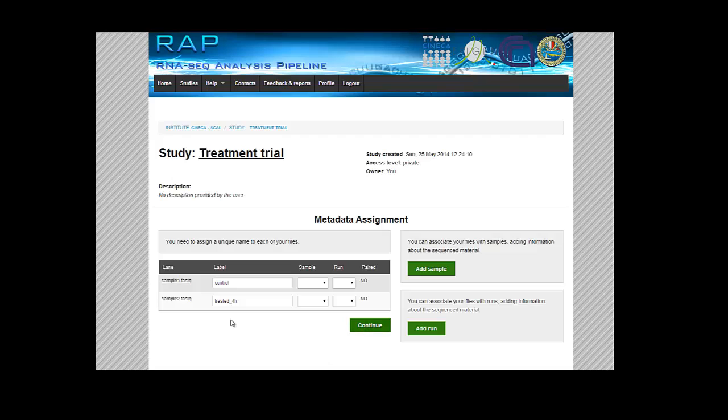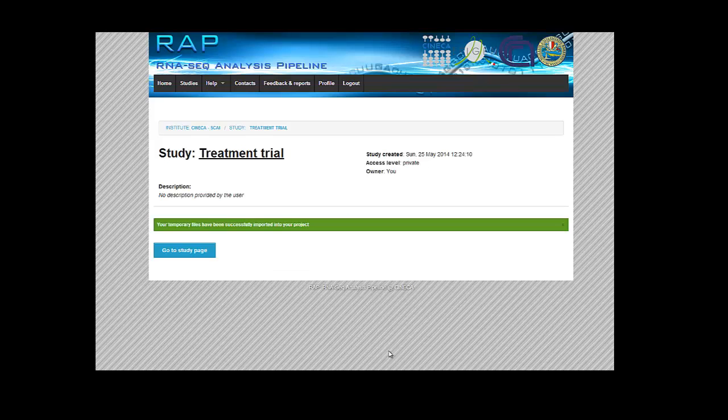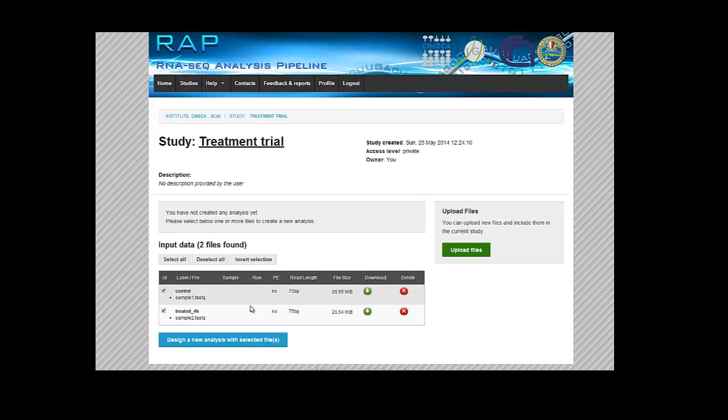So if we're happy like this, we can go on. You can see now the temporary files have been stored, and we can just go back to the study page section.